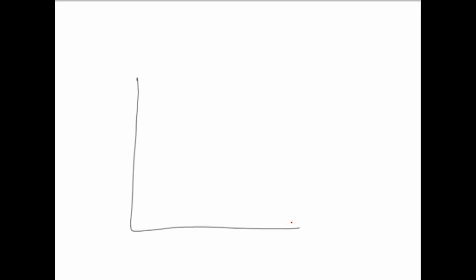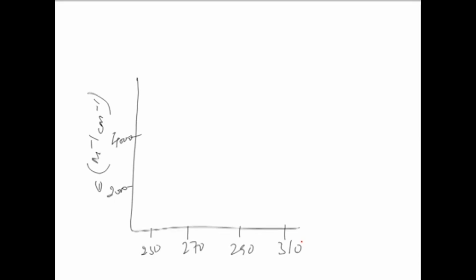For example, in terms of pH, if we have the molar absorption coefficient, or epsilon, in particular units, against the wavelength here, and I consider the two pH values, pH 6 and pH 13, as I was talking about, then there is a particular difference here.